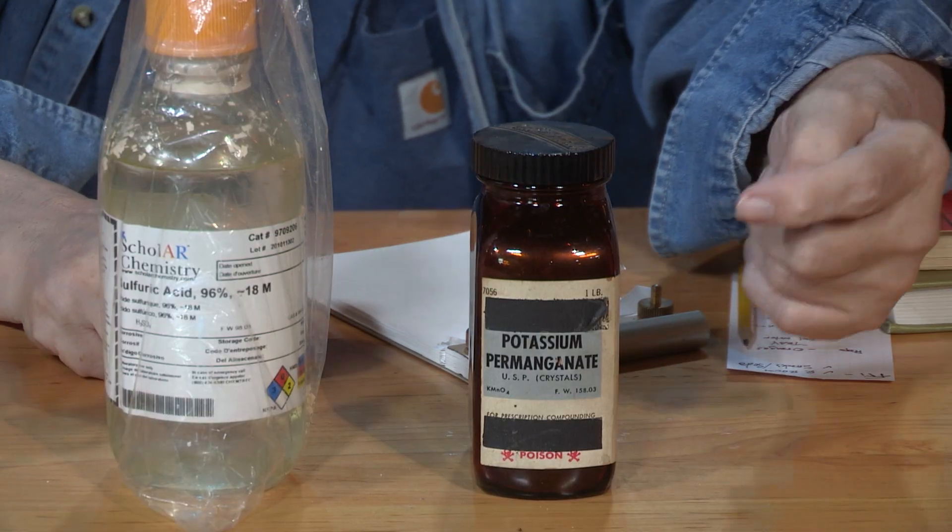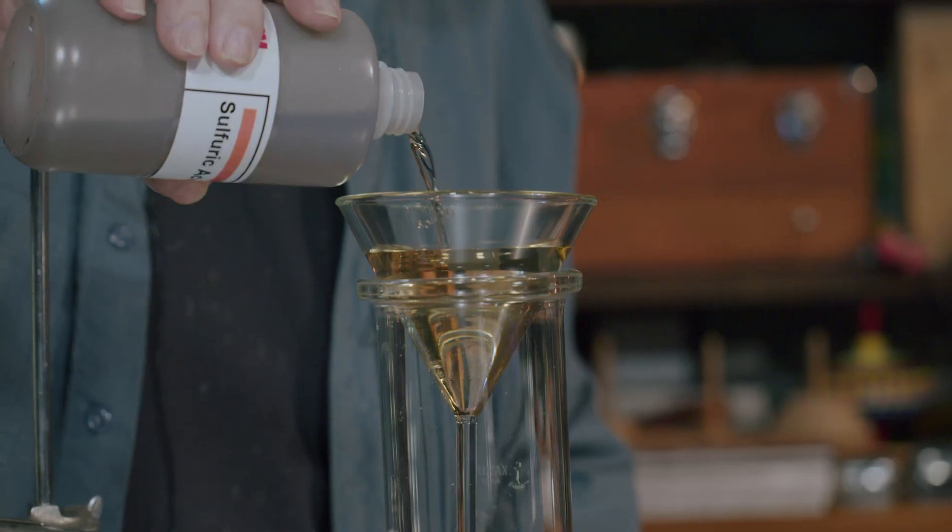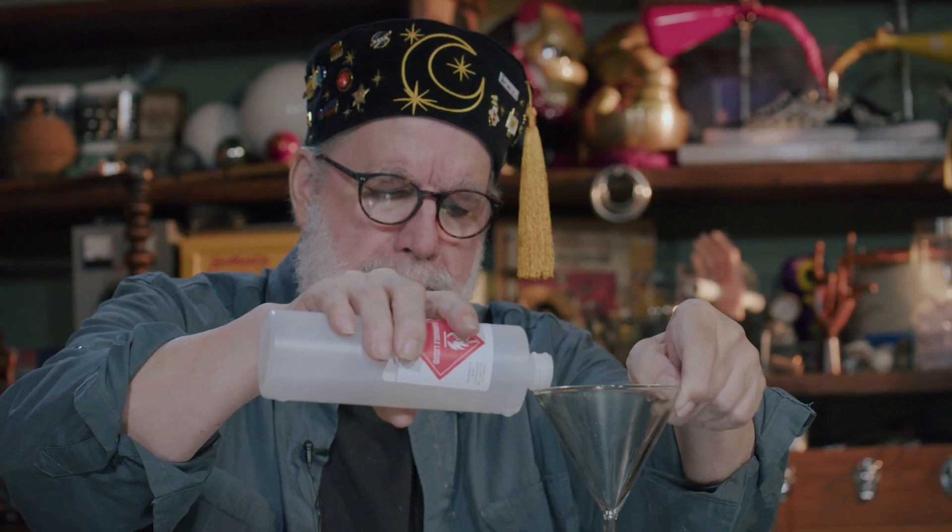I thought maybe I would have this preamble to an activity we're going to do — you're going to see this video later on — using three fairly dangerous chemicals, reagents: potassium permanganate, concentrated sulfuric acid, and methyl alcohol.